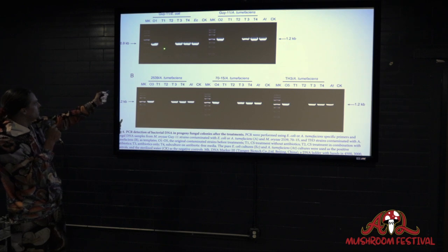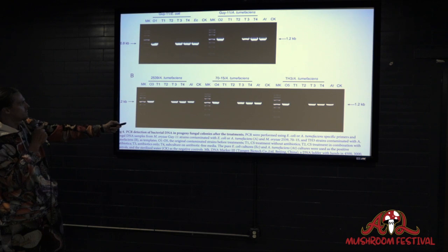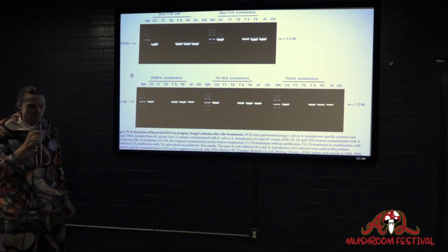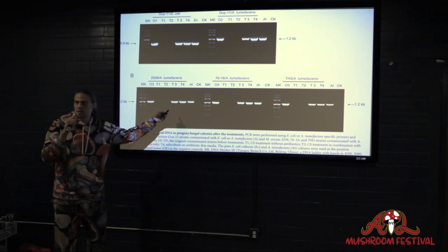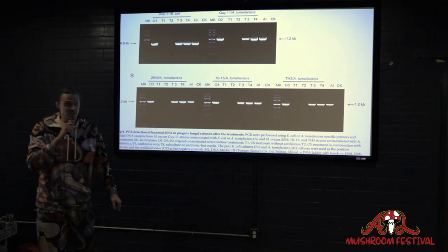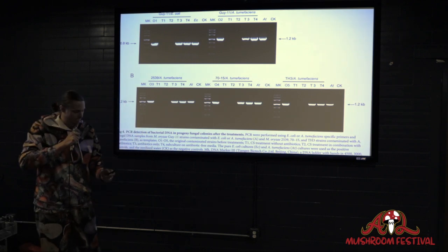And then you have these four right here. And T1, T2, for almost every single sample, you see nothing. And then T3, you see a presence. T4, you see a presence. So if you're just using antibiotics on your plate, still contaminated. If you're just running away from contamination, it's definitely contaminated. There's a greater than 95% chance, I can almost guarantee you it's still contaminated.